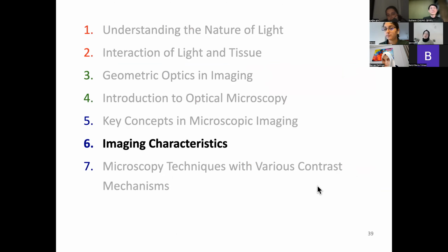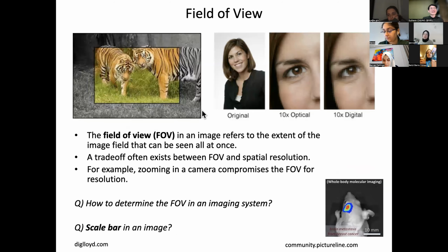All right, imaging characteristics. Whenever you are dealing with an image, when you read the literature, or when you're making an image to report, this is an example. I made this one with my own sample, and what matters is, when people look at this, they may not say, hey, is this a rat or a mouse? And you know they are very different sizes.